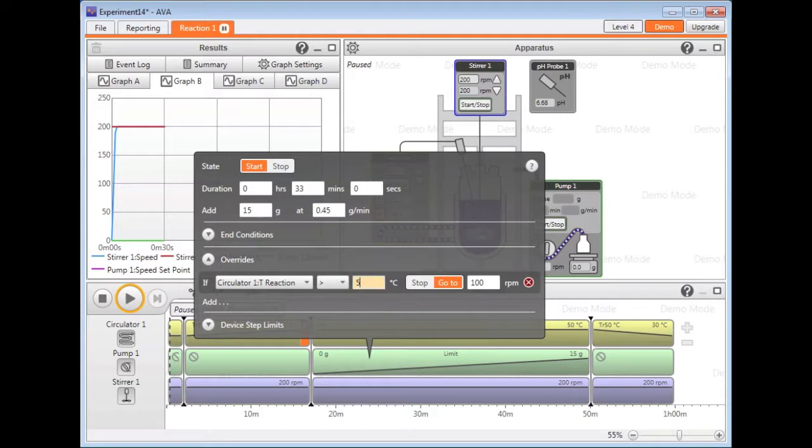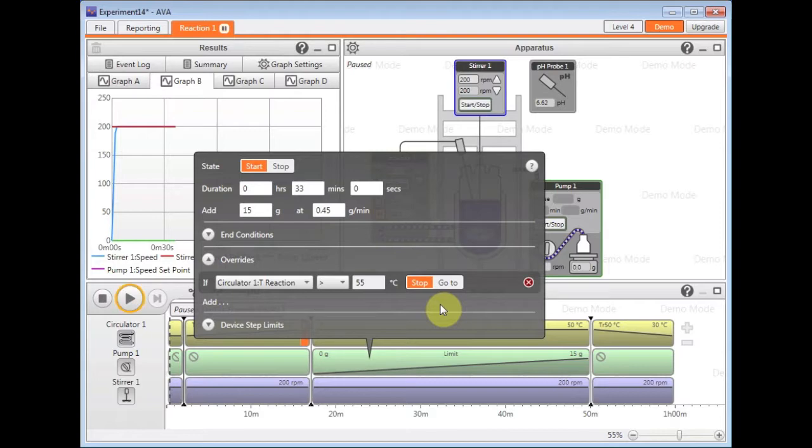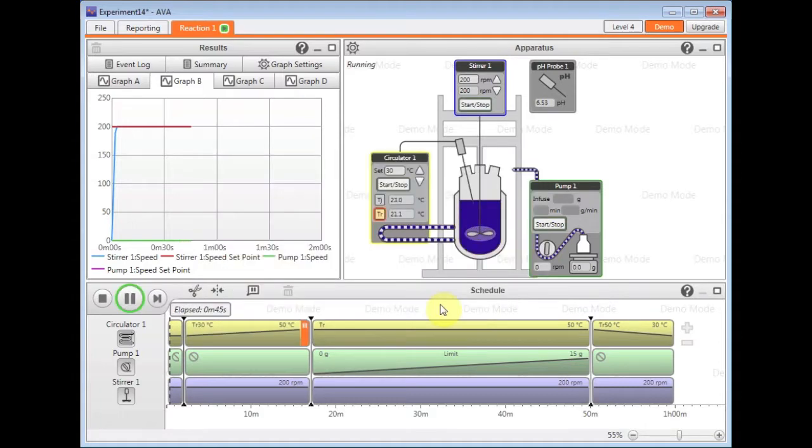Wait for the temperature to go back down to below 55 and then continue. So you can achieve automatic safety and control throughout any of your reactions using overrides.